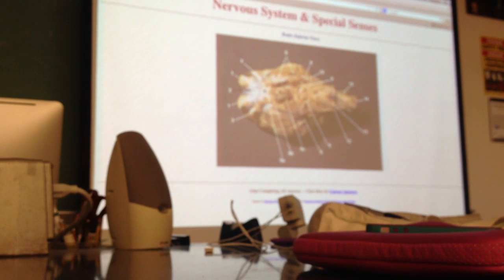Now the infundibulum comes out anteriorly from the pituitary gland. So in order to see the infundibulum, the best thing to do is push the pituitary gland, or pick it up and pull it back slightly, and you'll see that connection point between the optic chiasm and the pituitary gland right there. That'll be your infundibulum right there.